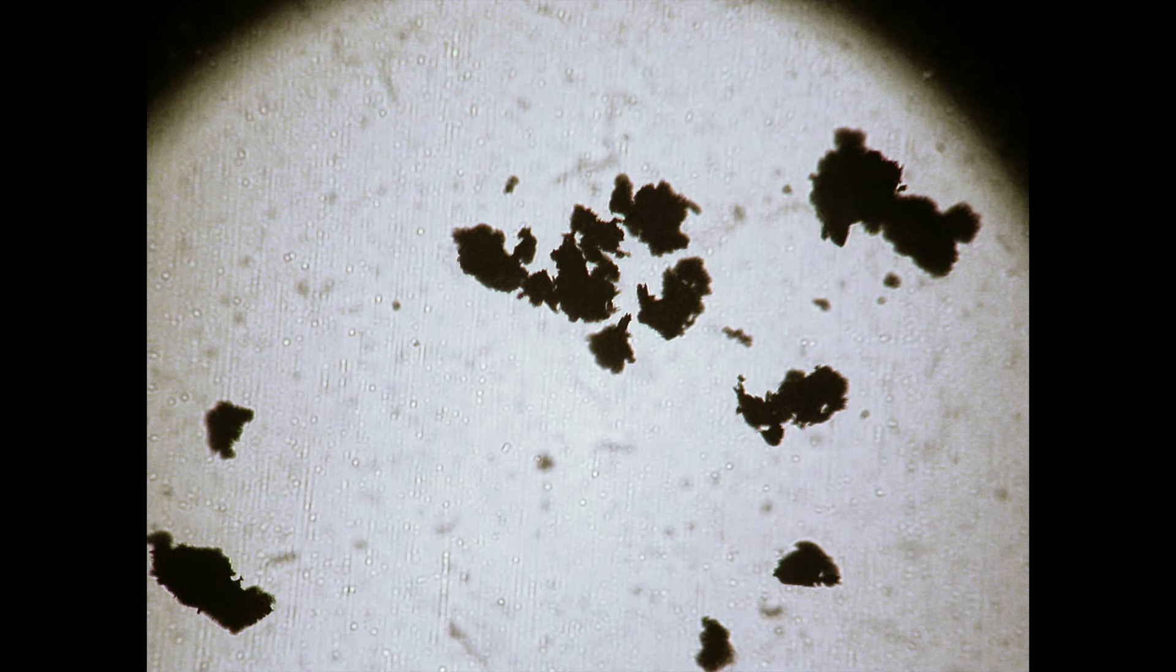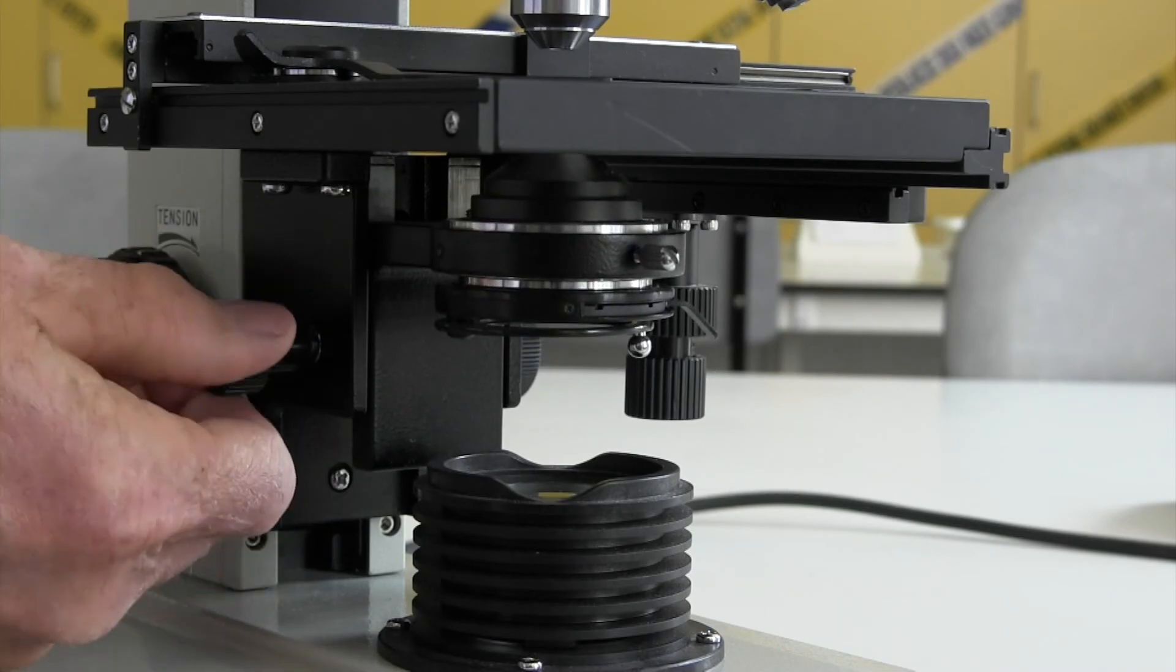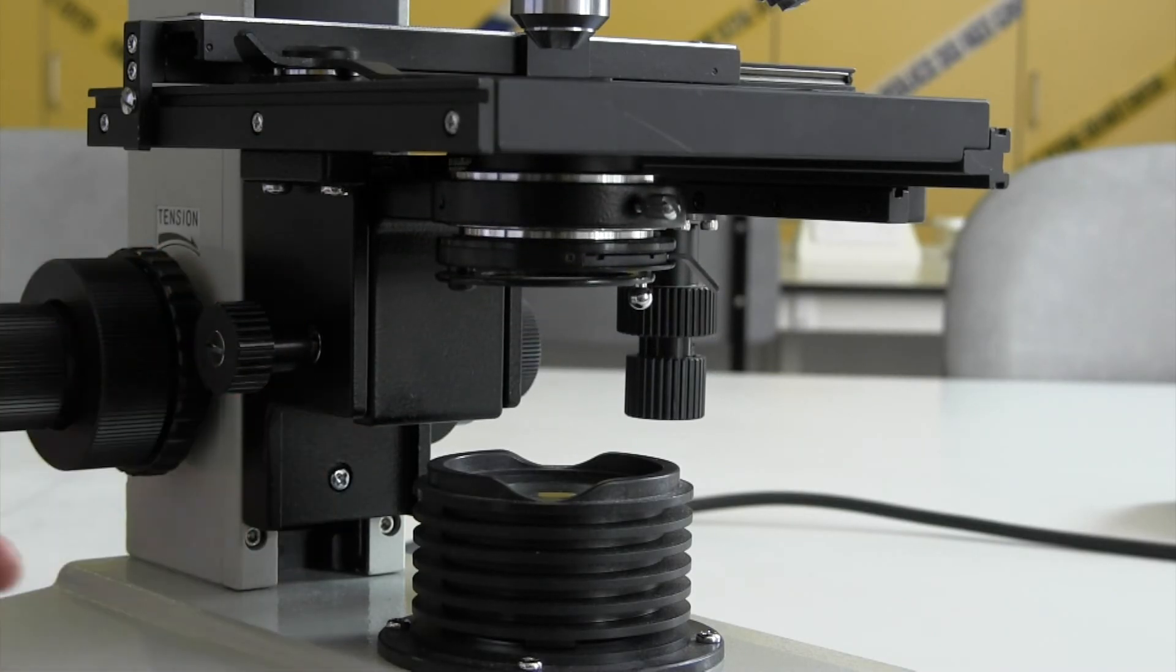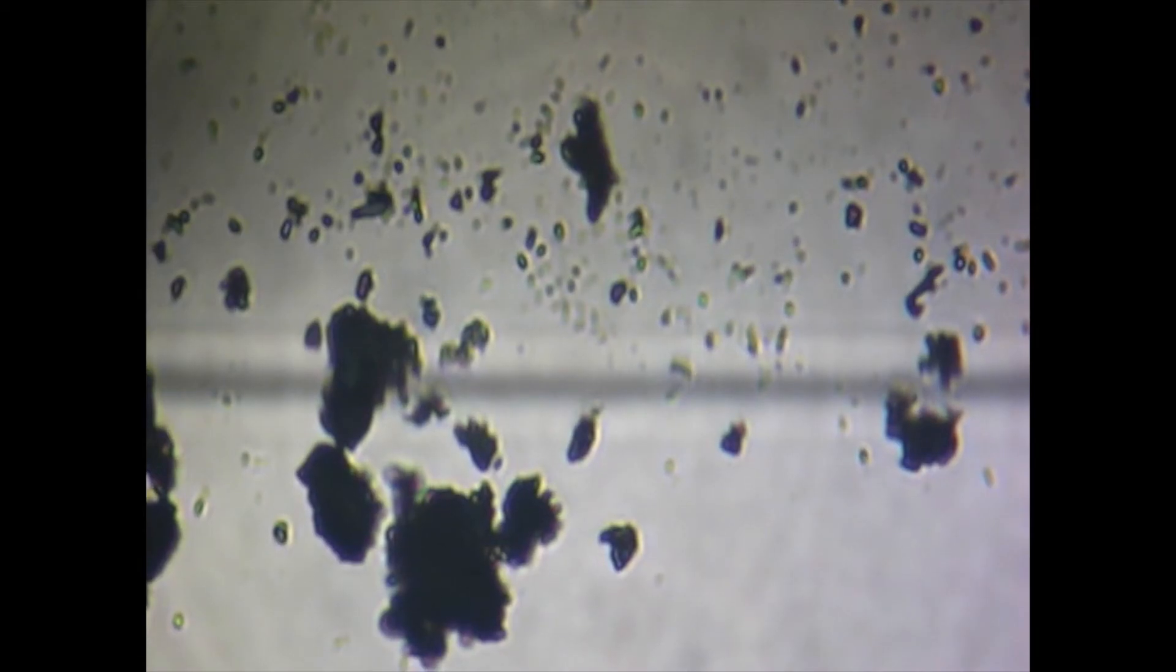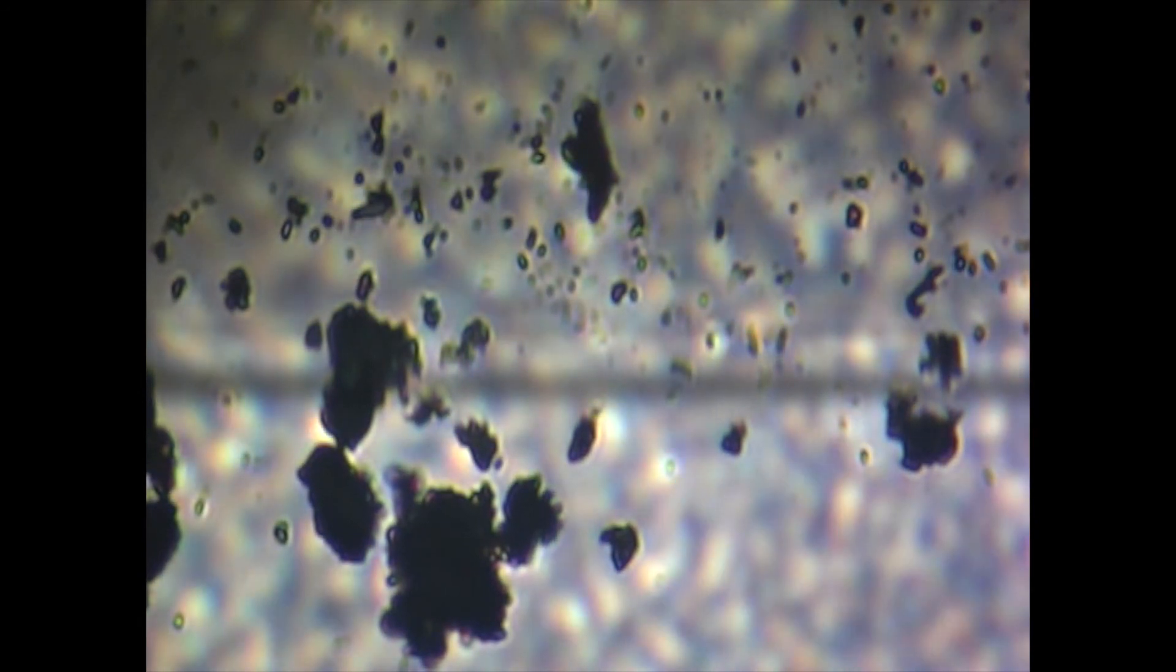The next step is to wind the condenser up to its stop point using the knob under the stage. Now look at your mark using the eyepieces and wind the condenser back down slowly until suddenly the background of your view will appear speckled or mottled as seen here.